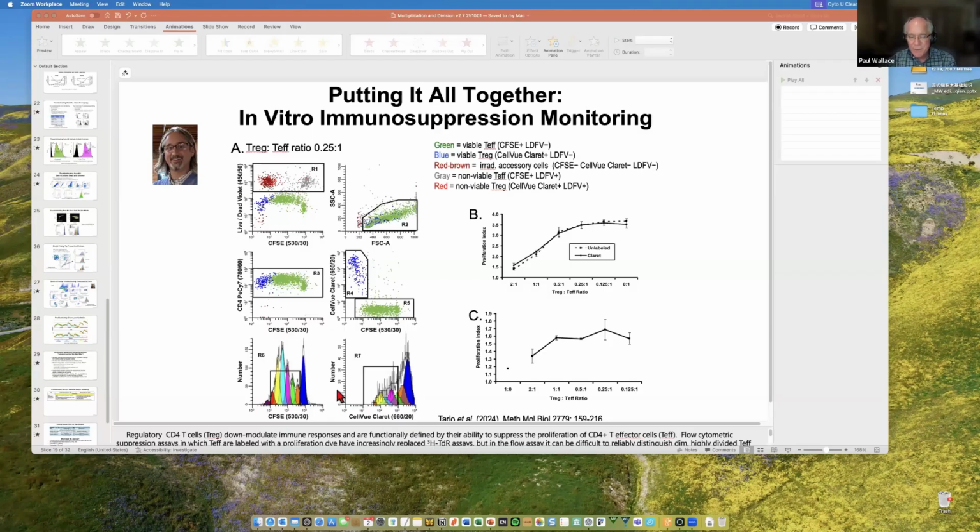This is a beautiful experiment that Joe did, and you can see he's doing all the things that Kathy told you, probably because Kathy told him how to do the experiment. He's gating out the dead cells, doing a nice general forward versus side scatter, and then using the CD4 marker as a way of gating in on the cells. Excellent. That's great. Thanks for that. Nice work, Joe, as well.